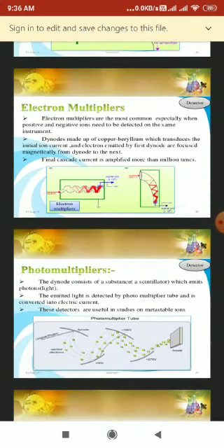Now we have seen the third type of detector, photographic detection. This detector system is more sensitive than any other detector because the photoplate integrates the ion signals over a period of time. The photoplates are processed by the usual photographic technique and read with the aid of a densitometer. Photographic detection is used effectively for high resolution in double focusing spectrometers.